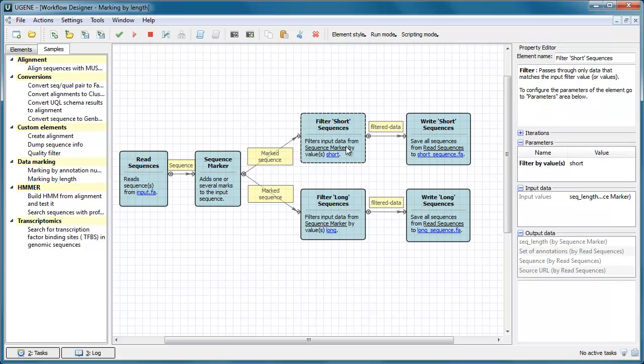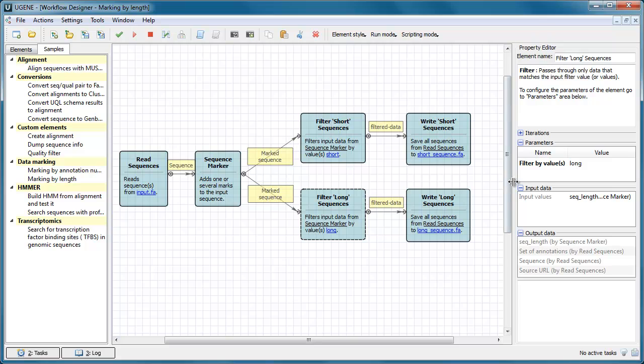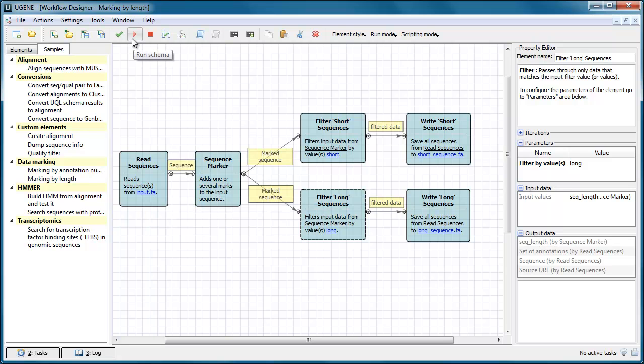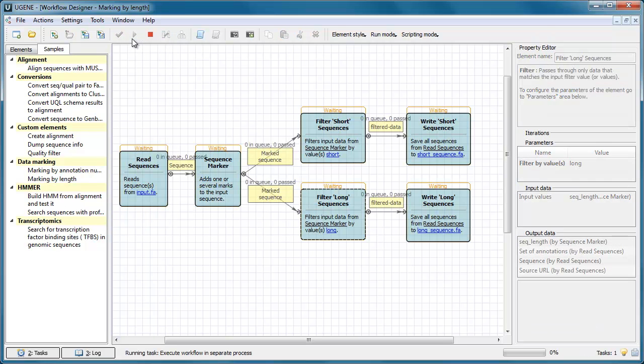In this sample, all input sequences are marked either with the short mark, if the sequences are shorter than 200 base pairs, or with the long mark, if the sequences are longer than 200 base pairs. To run the sample, select the input sequences and the names of the output files and press the Run button on the toolbar.